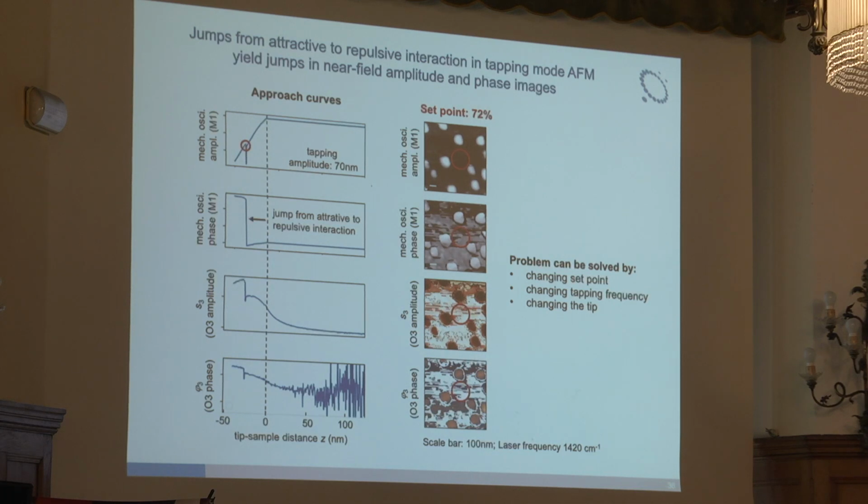But that depends on the mechanics of the cantilever and the status of the tip. Yes, it's not a general rule. No, it's very specific. Because if it's soft or stiff, it depends, and if it's more roundish or more sharp, it also depends.